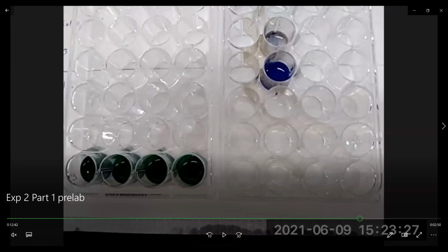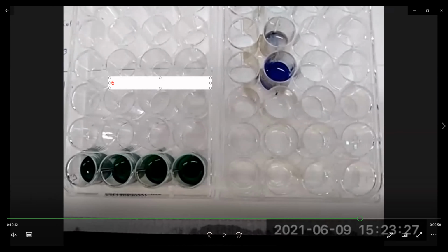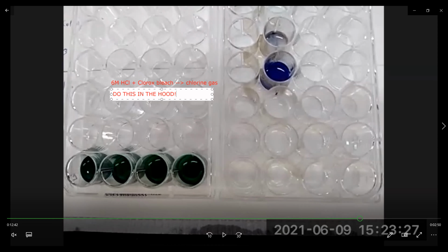Now, one key thing to remember when working with 6 molar HCl is that when you use 6 molar HCl with the Clorox bleach, this produces small quantities of chlorine gas. So make sure you do this in the hood. Go to the hood and make sure you do this part of the experiment there. Whenever you're reacting the bleach with the hydrochloric acid, make sure you do this part of the experiment in the hood.